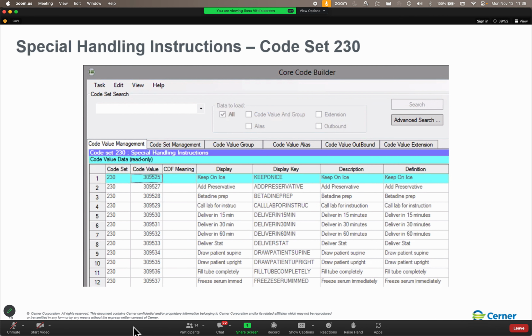Aliquot containers can only be associated in ColRecMate. So Bedrock has a little checkbox that says, yeah, it has alternate aliquot containers on it, but you can't actually do the association of them. So you've got to do that over in ColRecMate, Collection Requirements Maintenance.exe. Now, there is technically an old school copying application.